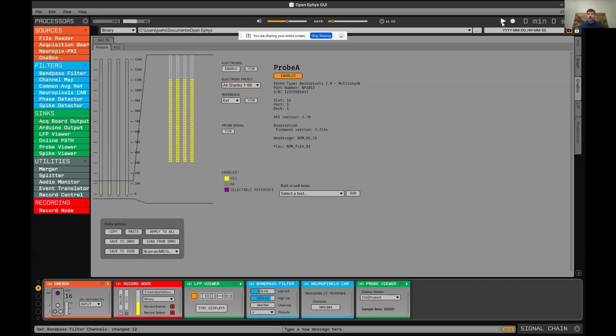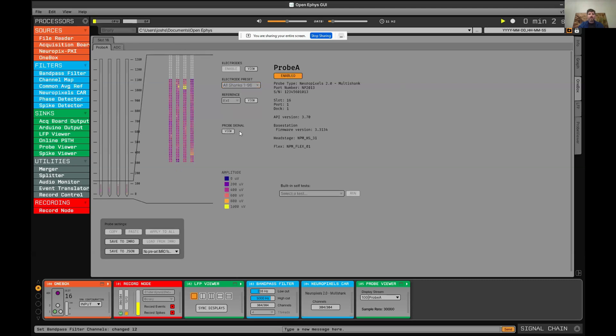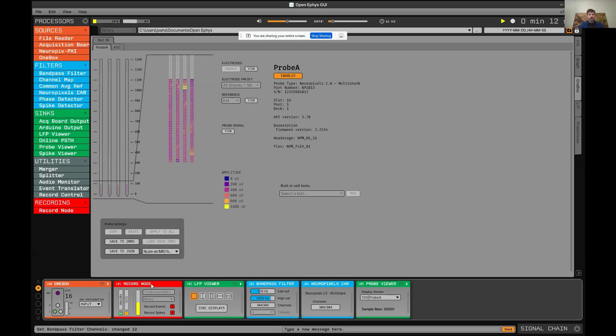If we then start acquisition and click this probe signal view, you can see live visualization of the activity on the probe. The data from this probe is going directly into this record node, which is what writes data.